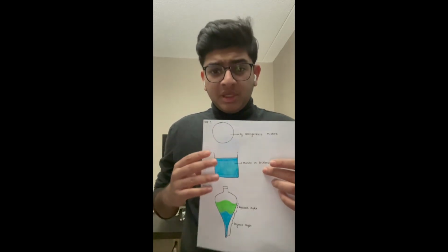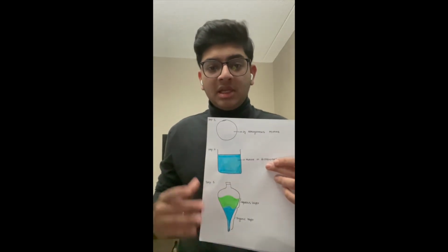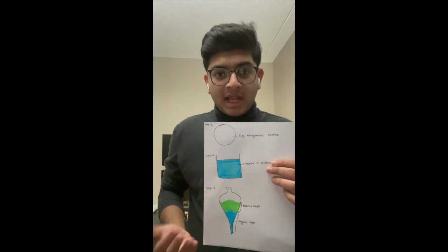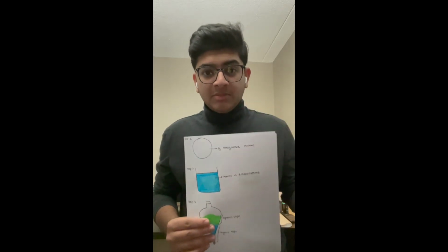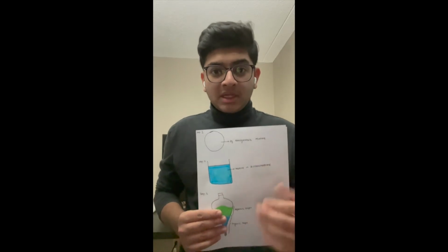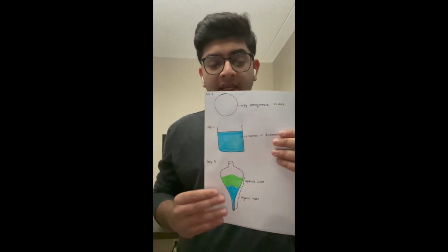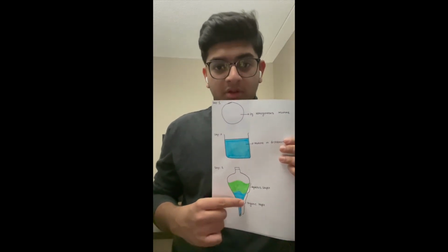So we mix our homogeneous mixture into dichloromethane and then put it into a separatory funnel, after which we add some water and base. Now, the reason for adding base is that the acids in our compounds would get deprotonated, which would make them much more soluble in water than in the organic layer. But caprolactone would not get deprotonated and is still better dissolved in our organic layer. Here we can see that dichloromethane is denser than water and hence it's at the bottom of the funnel.